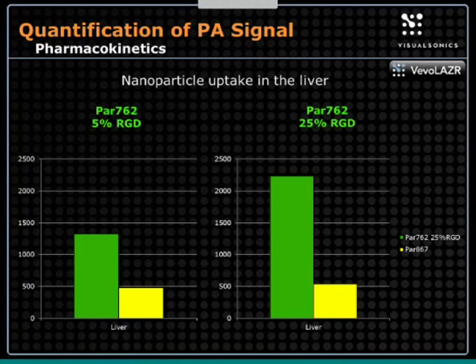But certainly, I'm sort of speculating here, but I guess you could have different tissues in a dish, and you put your particles in the dish, swirl it around, and if they're targeted to a specific tissue, you would be able to assess, after you wash it, the relative uptake of the particles in one tissue versus another. That's certainly possible.